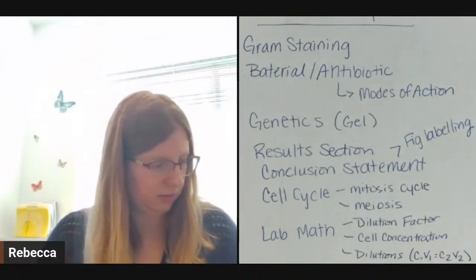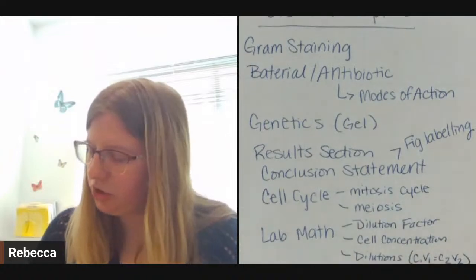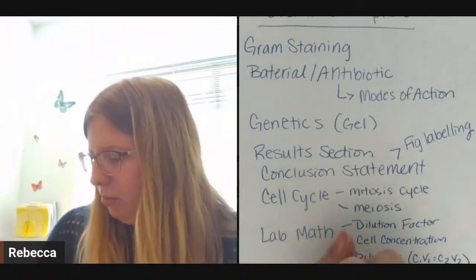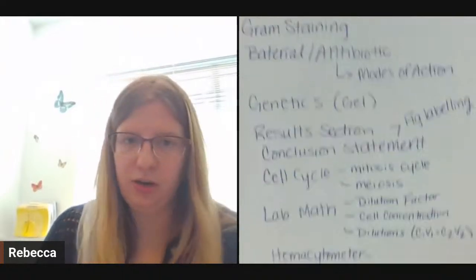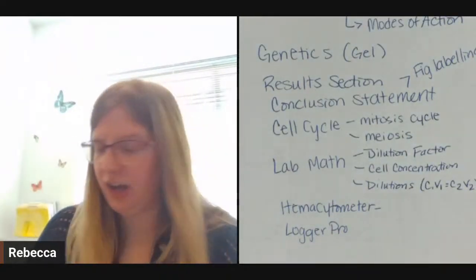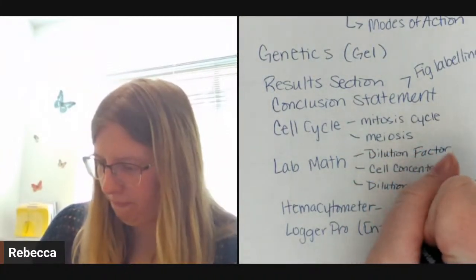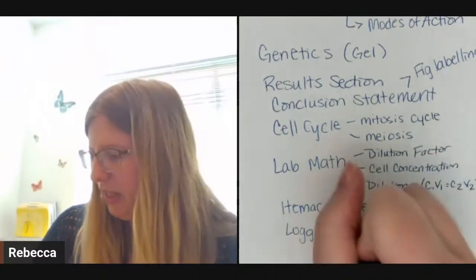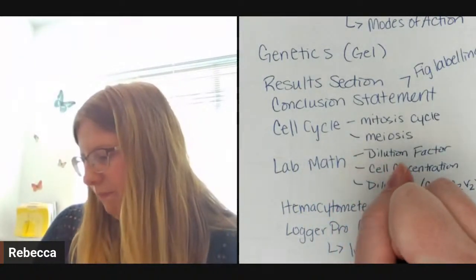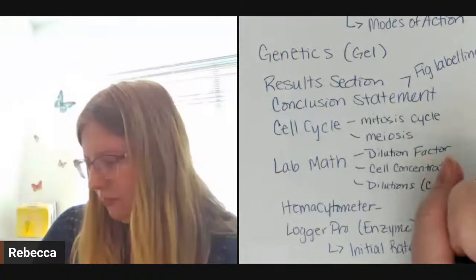And then, the week that we looked at these dilutions was when we were looking at Logger Pro, a program on our computer, and this was our enzyme week, right? And being able to measure with that an initial rate of reaction.